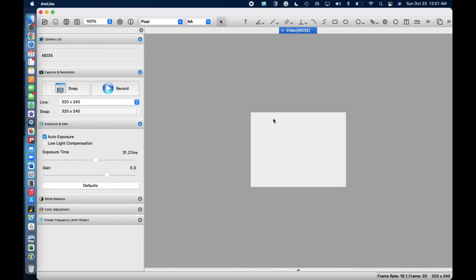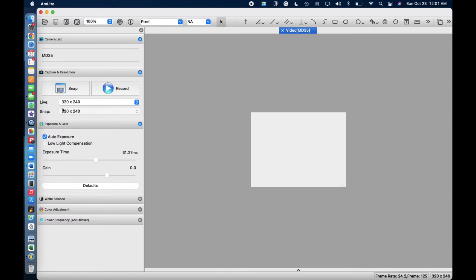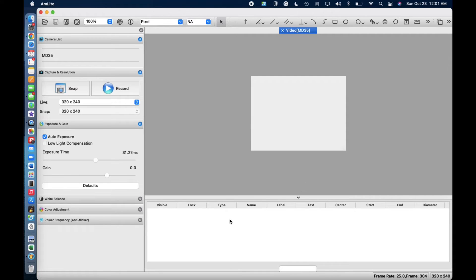Okay. There we go. And it'll show you this, the live, and then the snap. And your picture will usually appear here with all of this information as well.